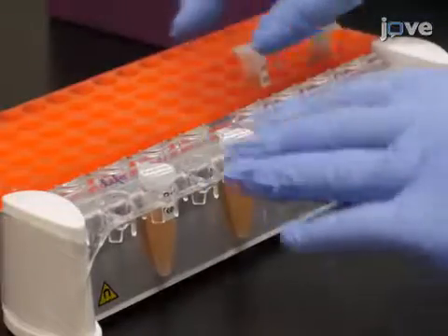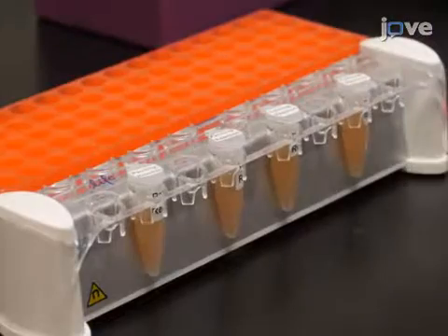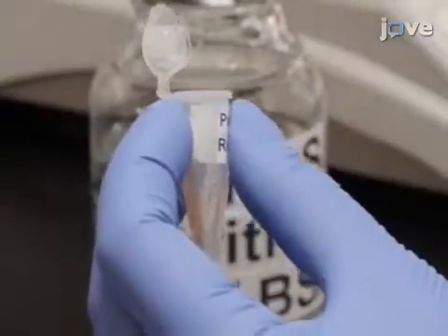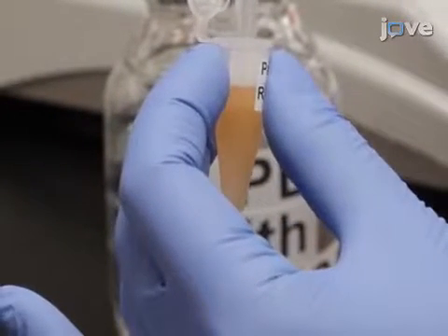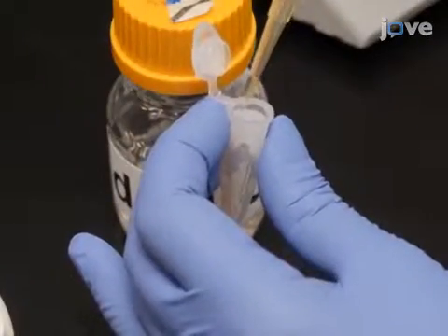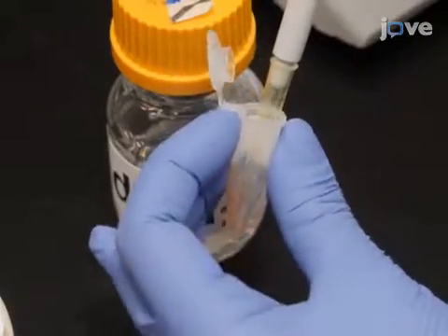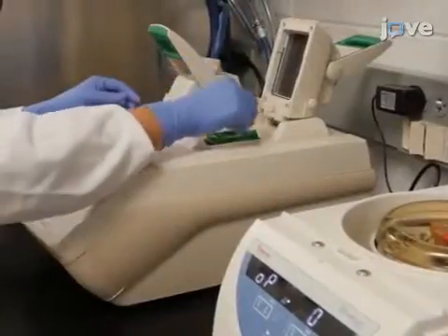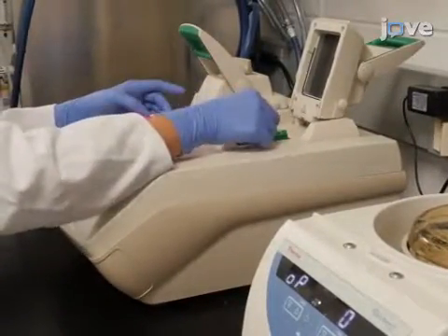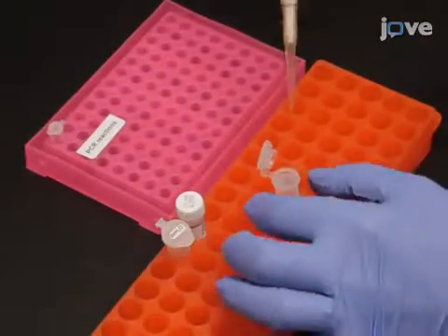To prepare the bead-bound spheroplasts for PCR, place the panning reaction tubes on the magnet for 3 minutes. Remove the supernatant and wash the beads with 1x PBS with 0.1% BSA 4 times. Then use 25 microliters of DDH2O per tube to re-suspend the beads. Perform whole plasmid PCR to amplify the genes for bead-bound SCFVs and then re-circularize the plasmid from the PCR product.